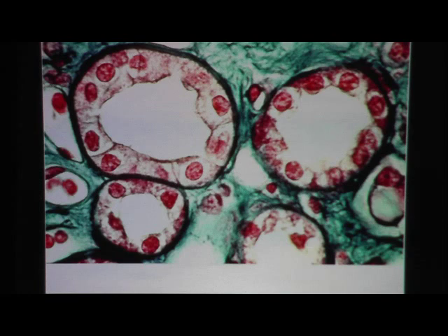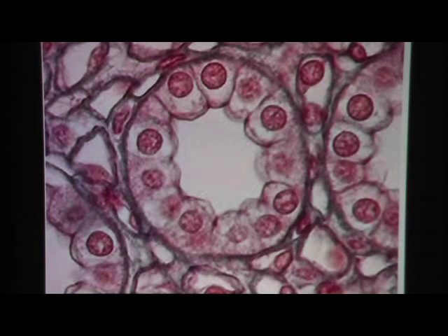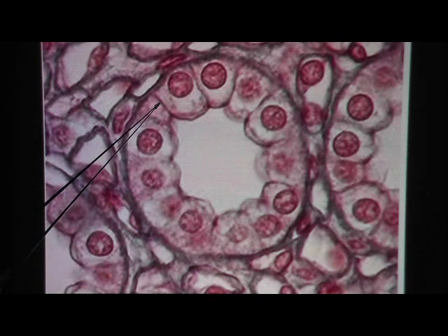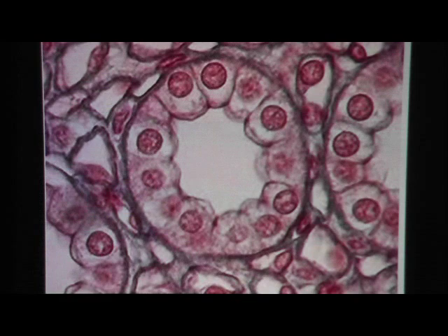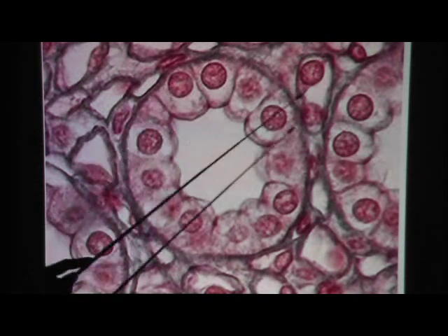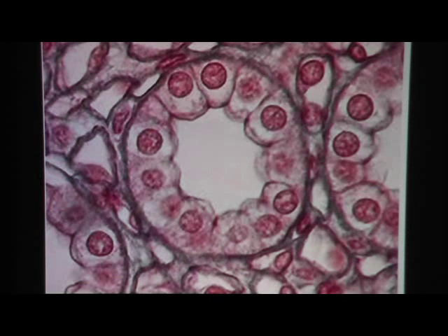We're still in the kidney tubule. Here's another view where the lines for the plasma membrane are very prominent. A good question might be to name the plasma membrane for this cuboidal cell. Note that some cells look a little taller than wide — that's within normal variation. You won't always get a picture-perfect cube, but there is acceptable variation. This is simple cuboidal epithelium, also in the kidney.